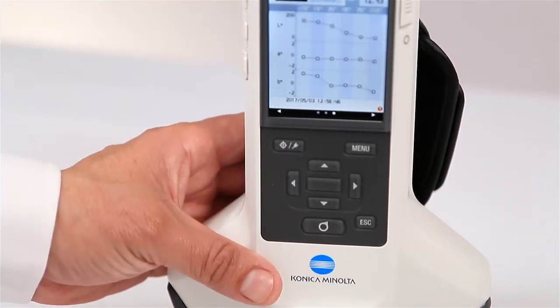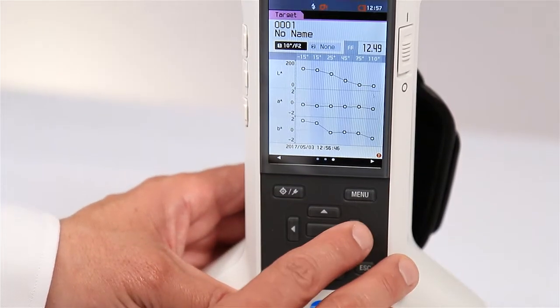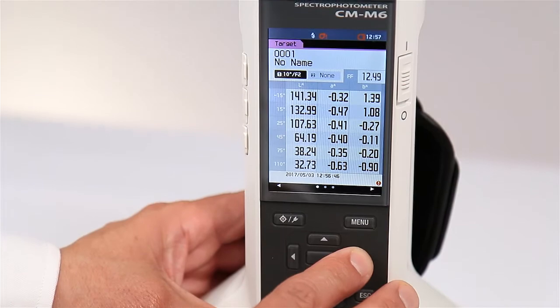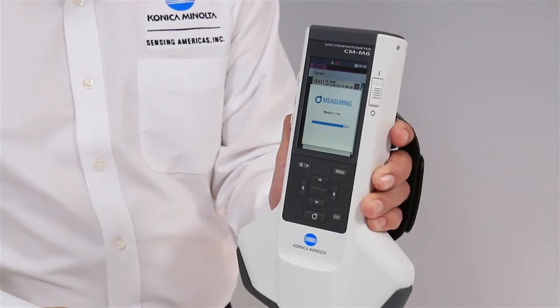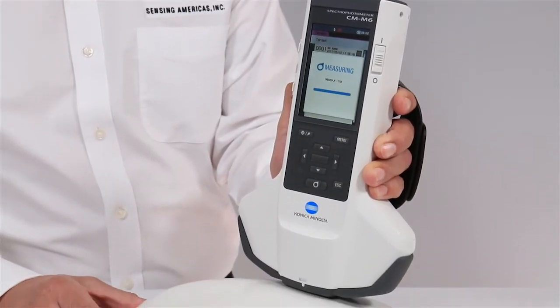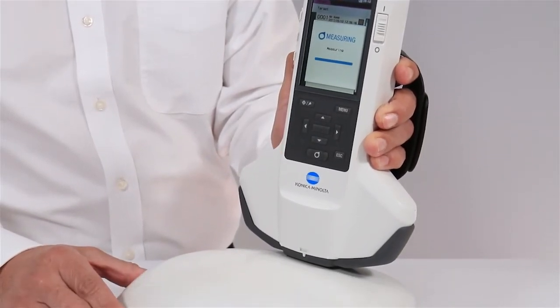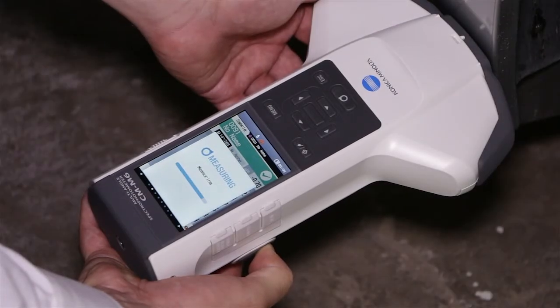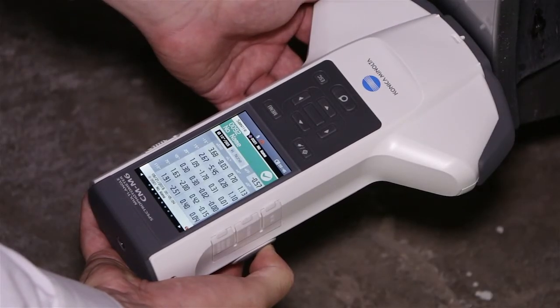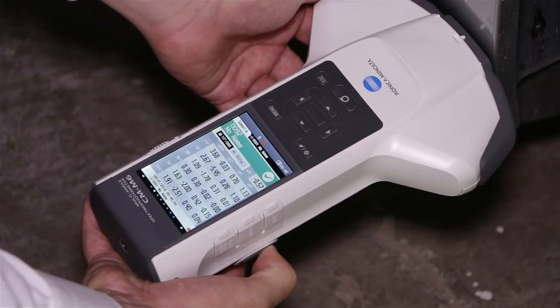Lightweight handling and a scratch prevention contact area provides comfortable and efficient operation. The CMM6 stores 1,000 measurements and averages them automatically.